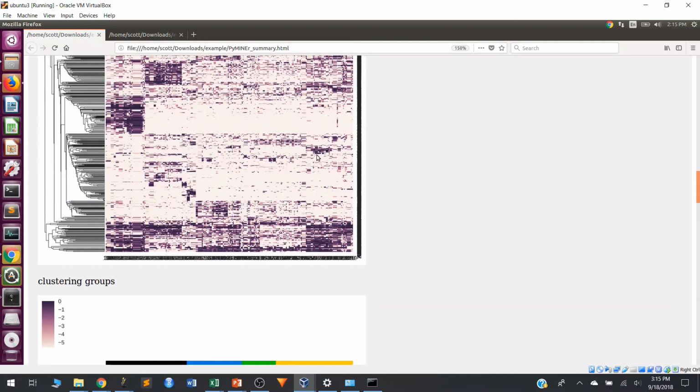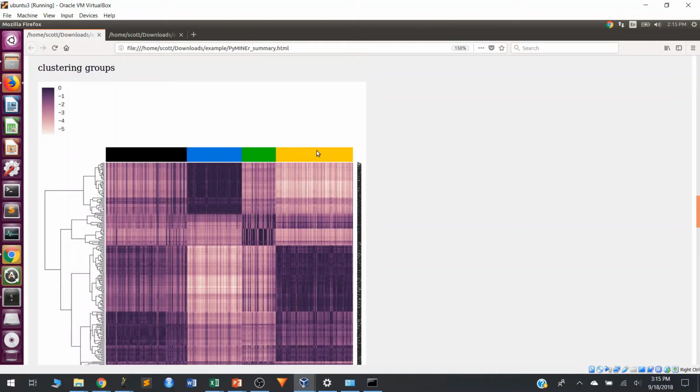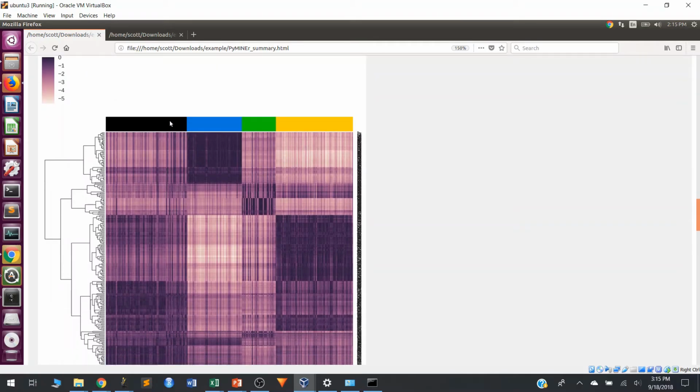And so this is a random sample of the genes that were used for clustering. In the default settings, this is going to be the over-dispersed genes. And this is, again, just a different view of the affinity matrix, where they're clustered by cell type here, and then unsupervised hierarchical clustering on the other axis.